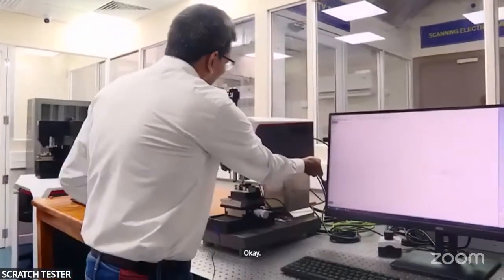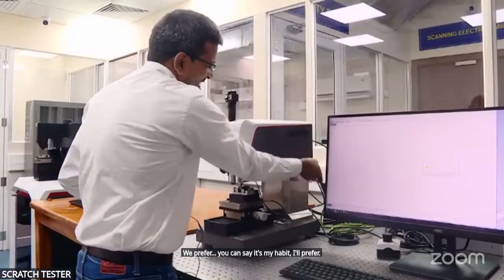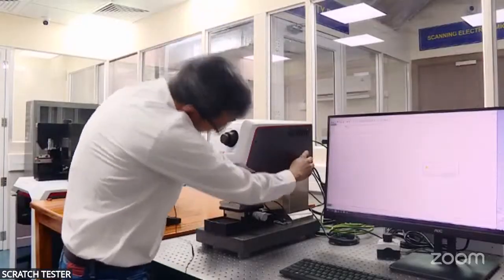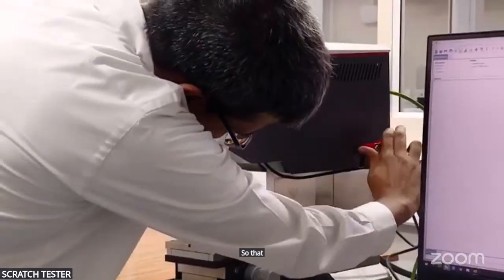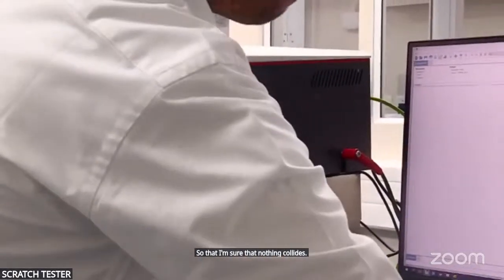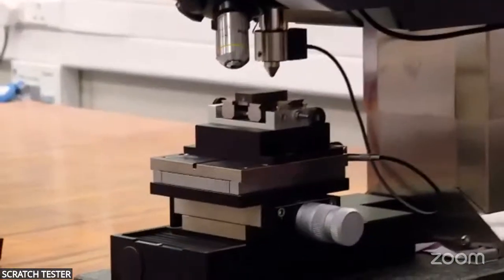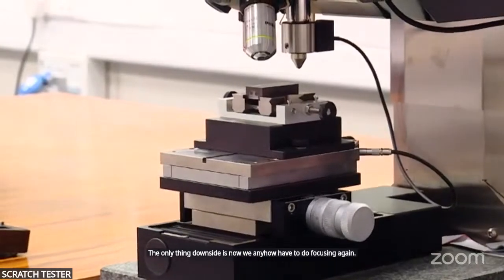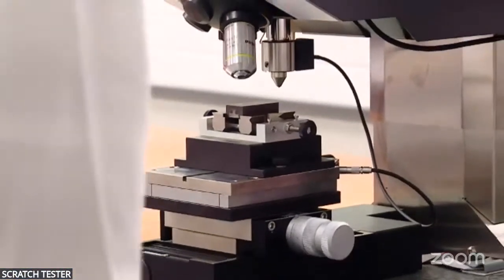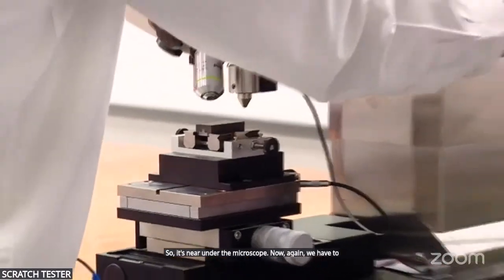You can say it's my habit. So we'll just move it a bit, not too much, so that I am sure that nothing collides. The only downside is now we anyhow have to do focusing again. So it's near under the microscope. Now again we have to do it because of focusing.